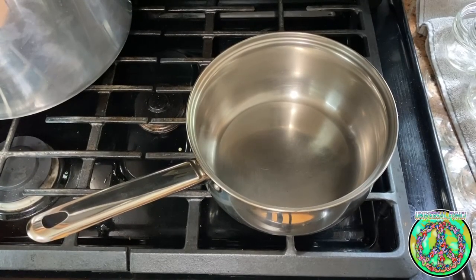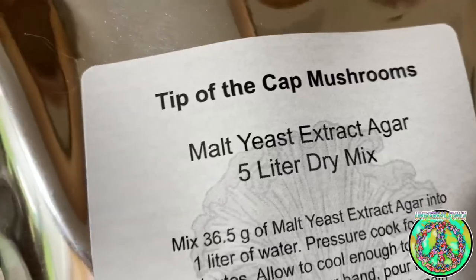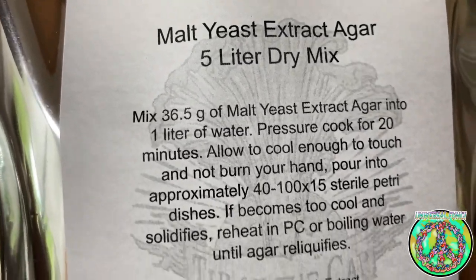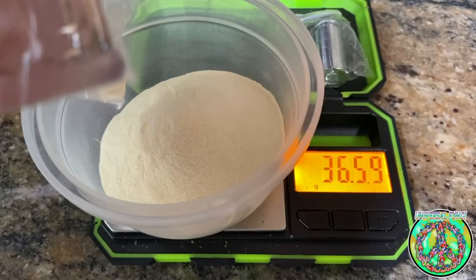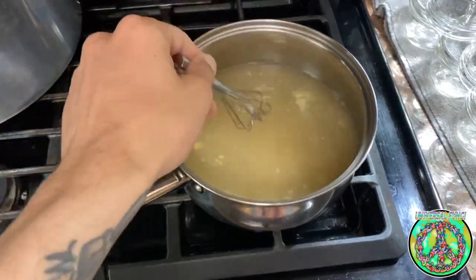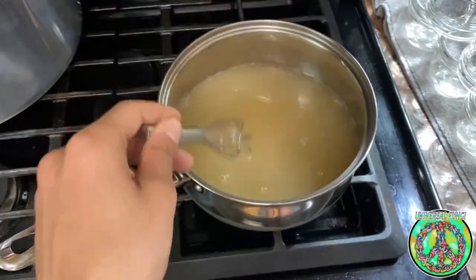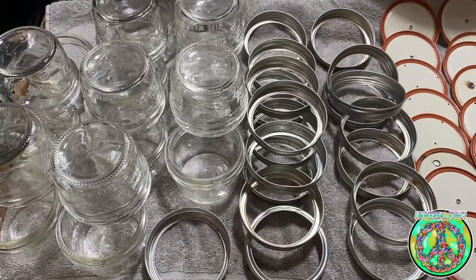While the mason jars are air drying, I fill the pot with one liter of cold water and I measure out 36.5 grams of dry mix malt yeast extract agar from Tip of the Cap Mushroom on a gram scale. I put the pot with the one liter of water on the stove and turn the heat on to high. I add the dry mix to the pot and wait for the agar to come to a boil.